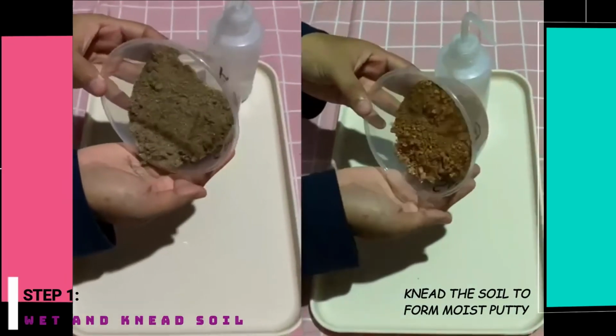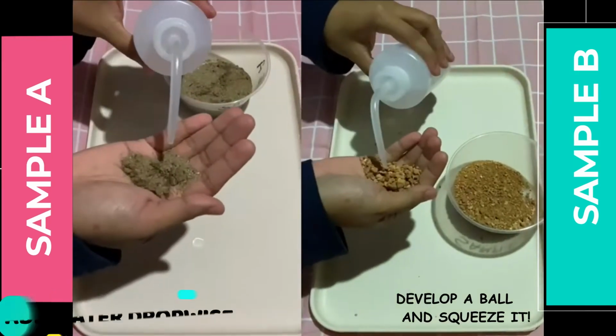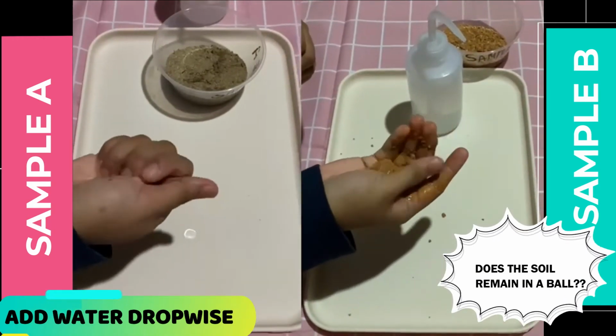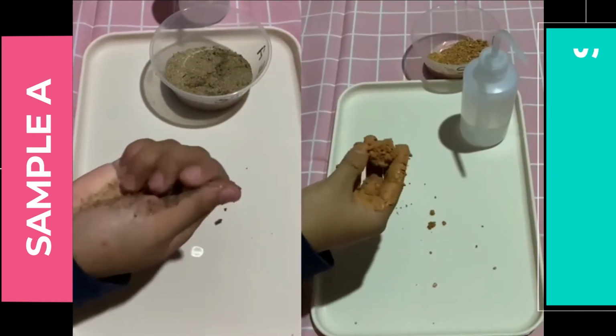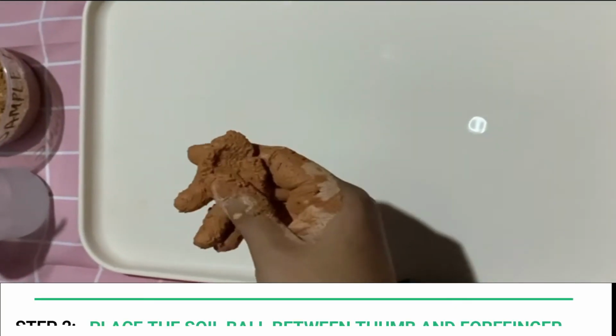Place approximately 1 tablespoon of soil in the palm, add water drop-wise, break down all aggregates, and knead the soil to form a moist putty. Develop a ball with the wet soil and squeeze it. Does the soil remain in a ball? Place the soil ball between thumb and forefinger.